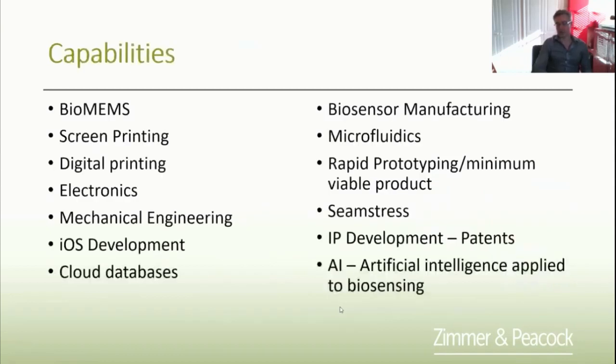We are here to talk about biosensors. If you want to make a biosensor, you probably have to be familiar with at least some of the following. If you've got a background in MEMS, that's great. If you've got a background in thick film printing, that's useful.